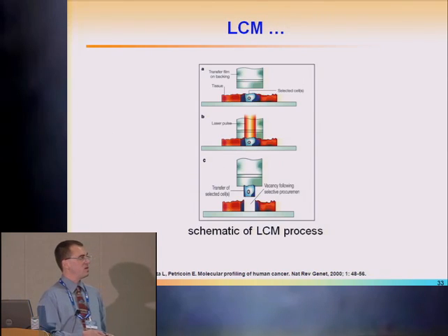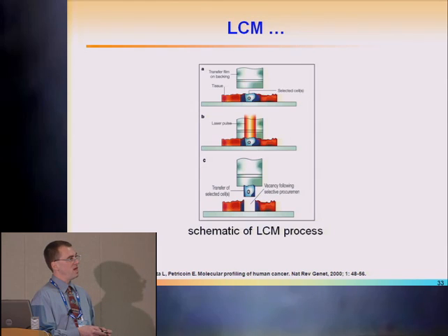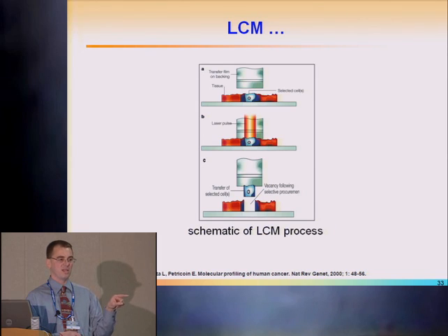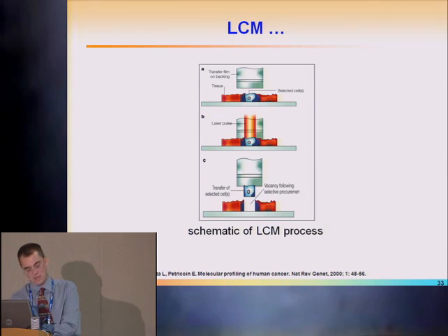Moving on to laser capture microdissection. Here's a schematic where you have the tissue mounted on a carrier. You have the laser cutting out at the cellular level, of course larger if you would like. And then the sample is extracted, and the nice thing now is that this can be moved into an Eppendorf vial and submitted to any standard LC-MS or just mass spec analysis, or for that matter any analysis. And the computers now will follow where these cells were extracted. So you actually make an image of the tissue, although you do not do direct tissue imaging.